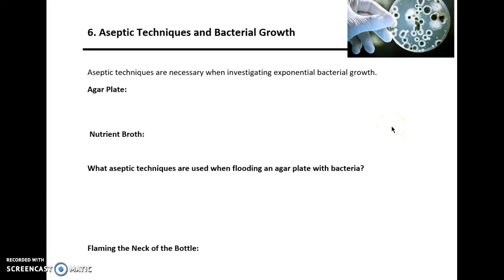Hello and welcome to TeachingBio. Today we're going to talk about the sixth required practical for AQA A-level biology, and this is the use of aseptic techniques and investigations into bacterial growth.